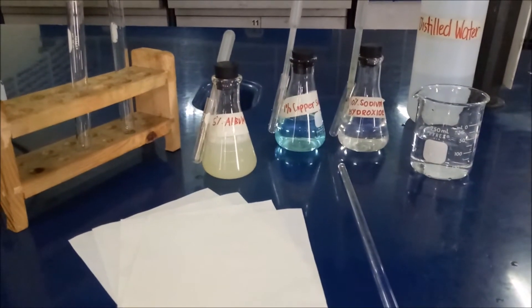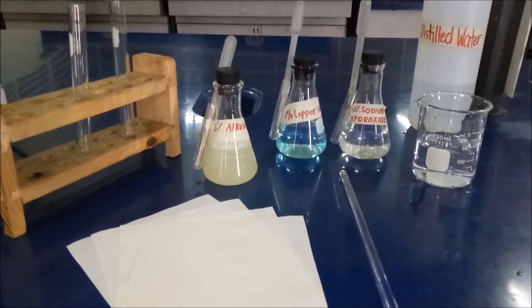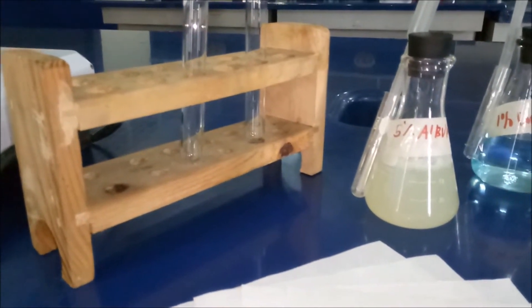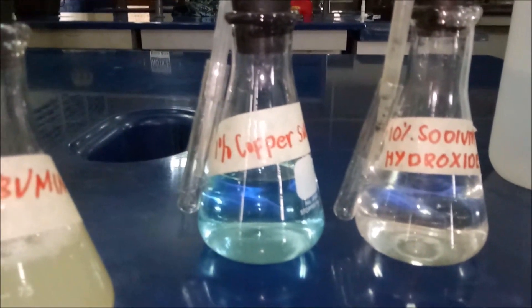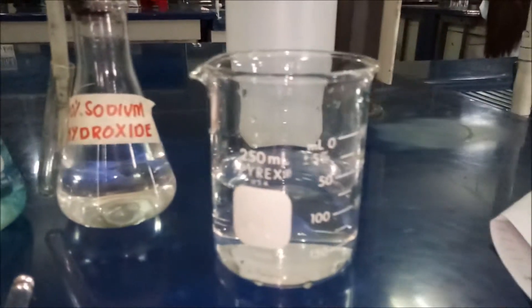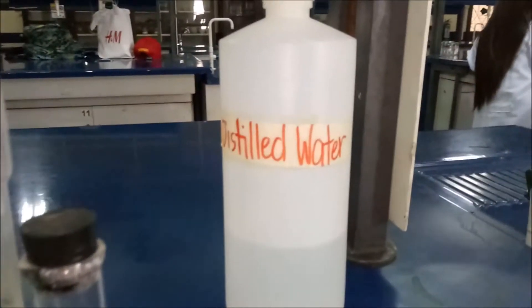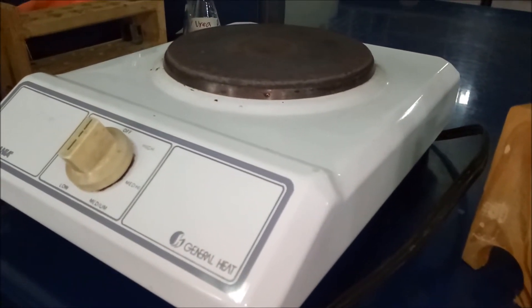The second experiment is entitled coagulation. So the materials that we need are test tubes, test tube holder, 5% albumin, 1% copper sulfate, 10% sodium hydroxide, beaker for the water bath, distilled water, filter papers, stirring rod, and lastly the hot plate.